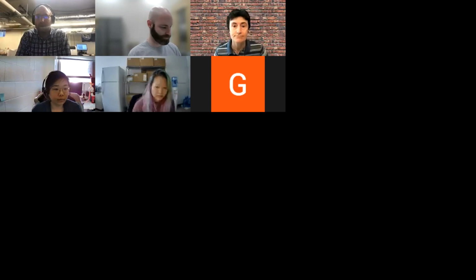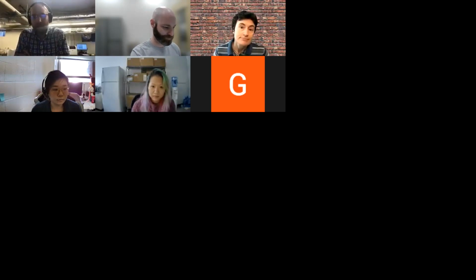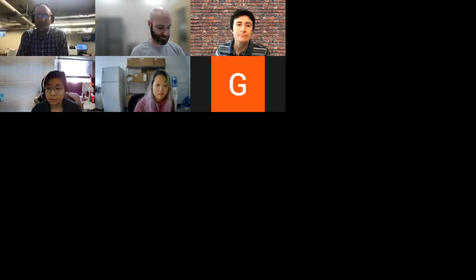And I don't think I saw that in your slides, that bias toward the generic with the pangoLEARN, and then adding --UShER, in my experience, you got better specificity for some of these. I don't have anywhere near the volume you have, but I wonder if you also observed that generic versus specific difference between pangoLEARN and UShER.